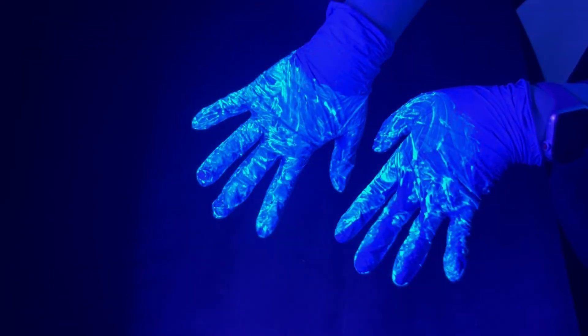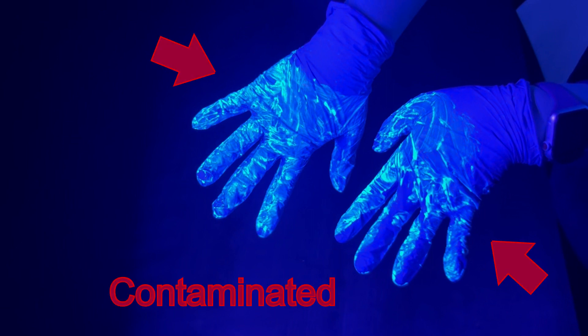After you've finished with whatever work had to be done, the outside of the gloves will be contaminated. Throughout this video, contamination will be shown under black light, and will be represented by the fluorescent solution you can see here, on these contaminated gloves.